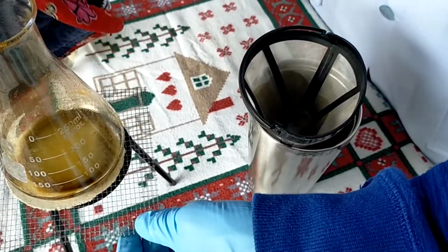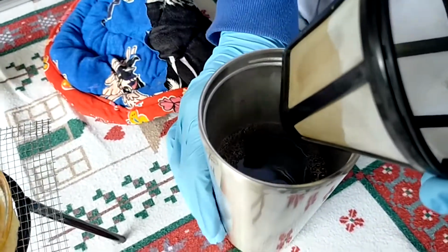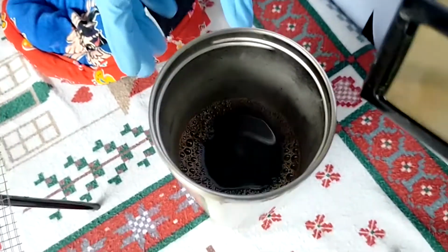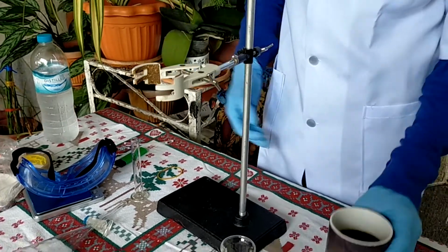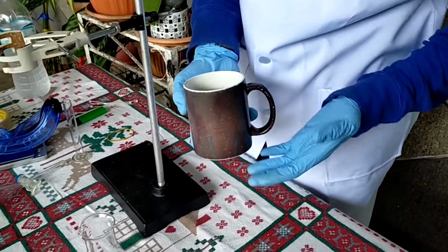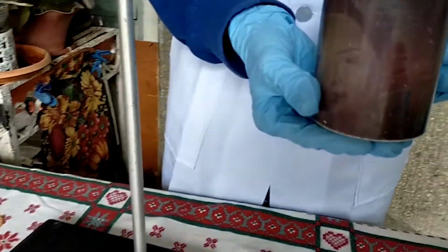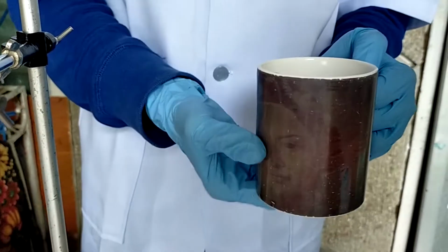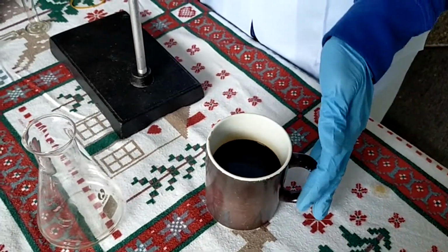I will let it cool here in this cup. So I have my coffee cold. I transferred it into this mug. It's a heat sensitive mug, and you can see my grandmother's face is not anymore visible. So we can safely say that it's pretty much cold enough. So what we're going to do is we're going to put 50 milliliters of this into our separatory funnel.